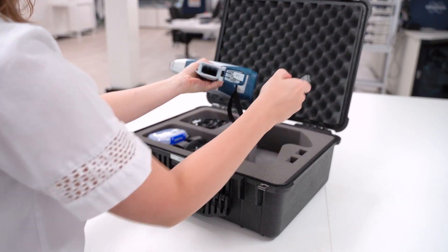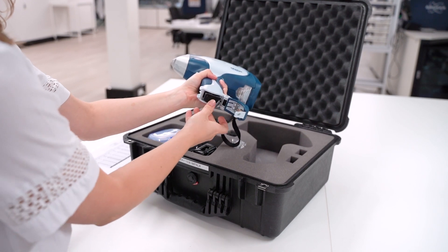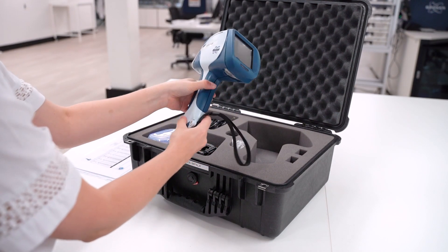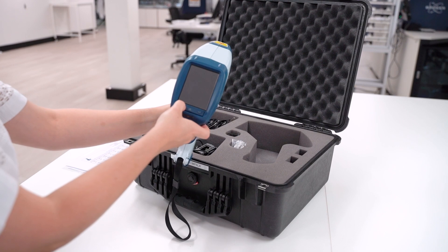First things first, we're giving the instrument some power. So we're inserting a charged battery or a mains power cord. Press the power button to turn it on and the login screen will appear.